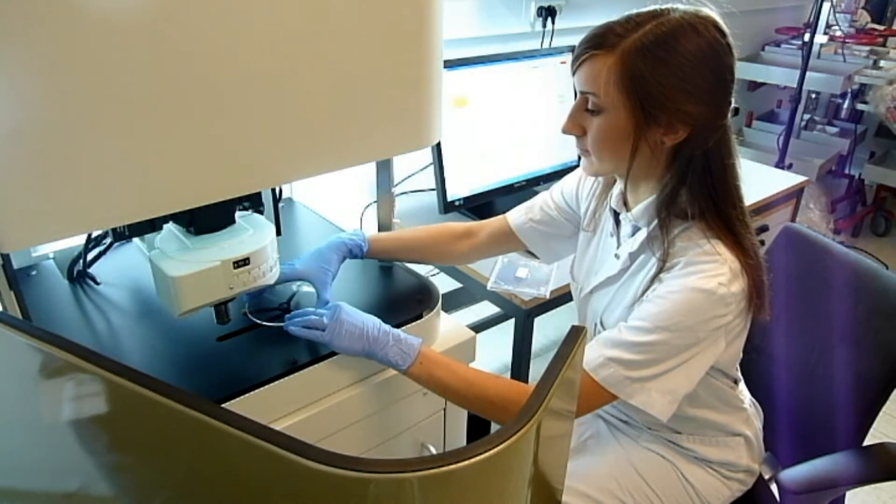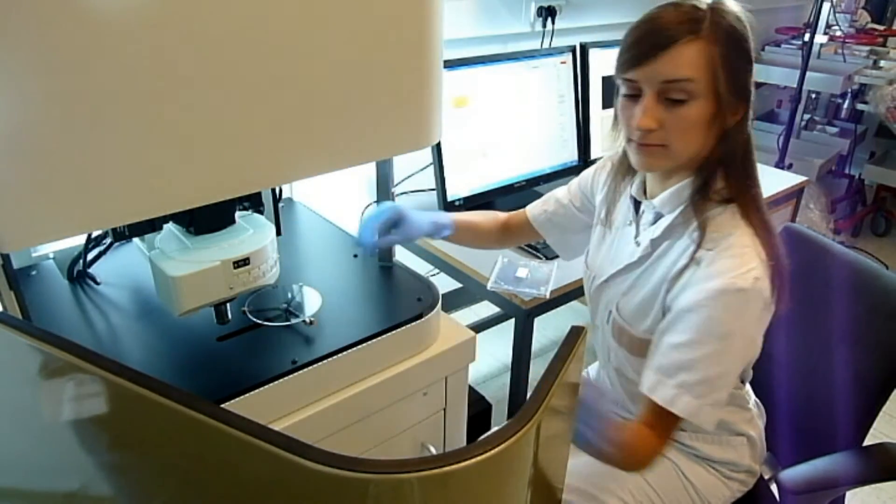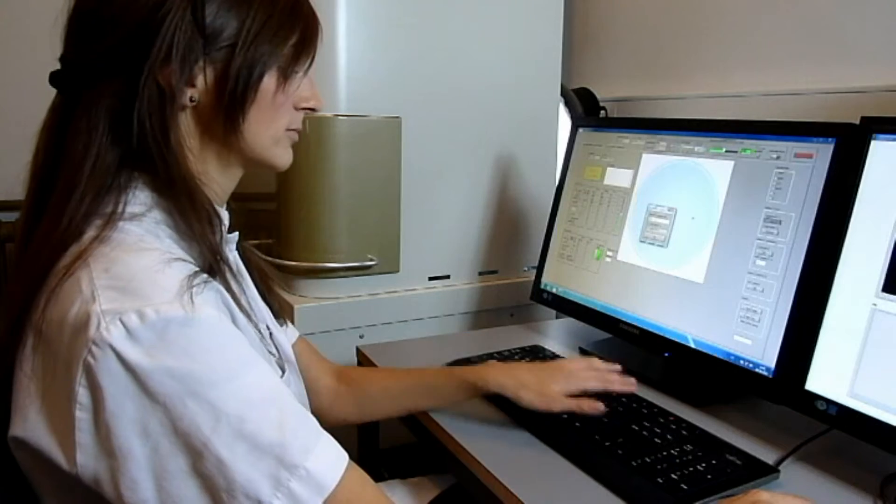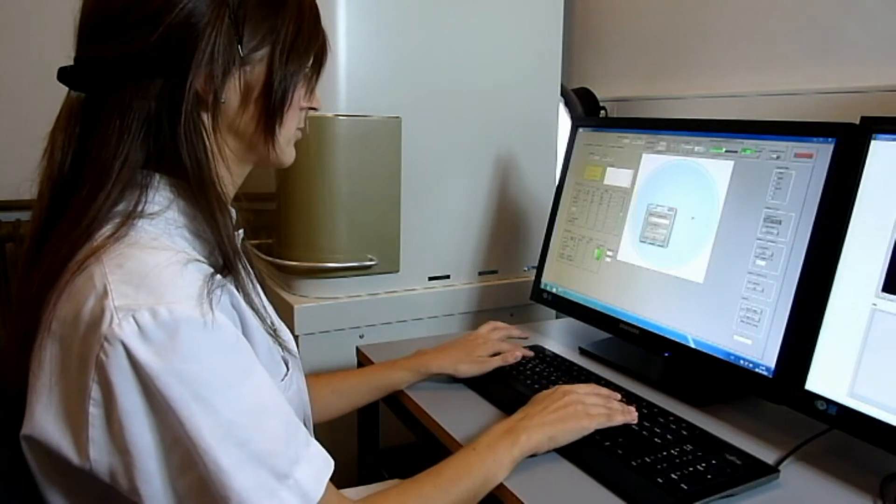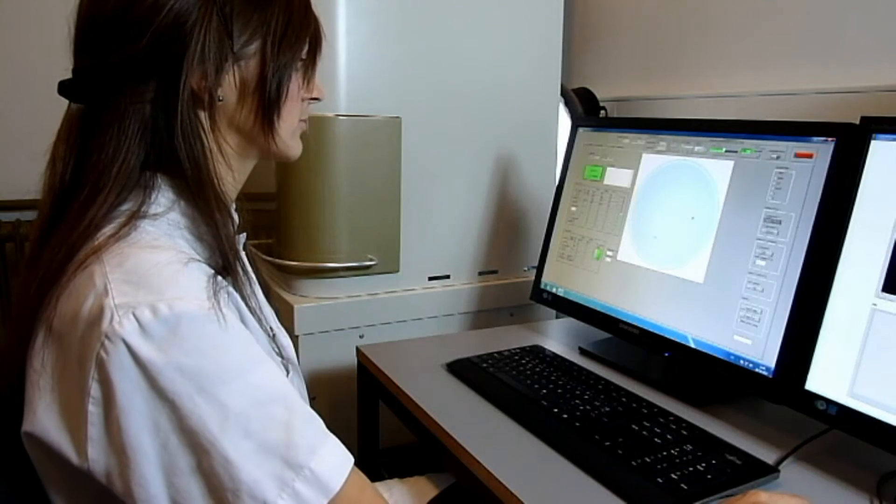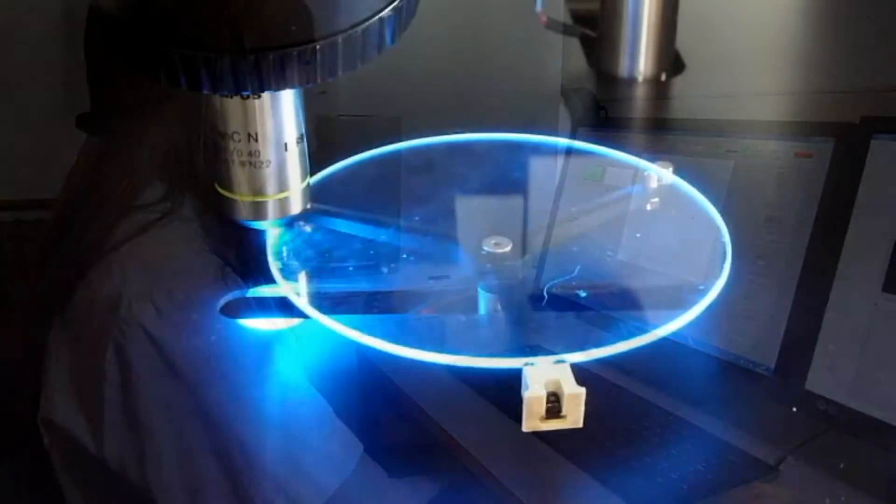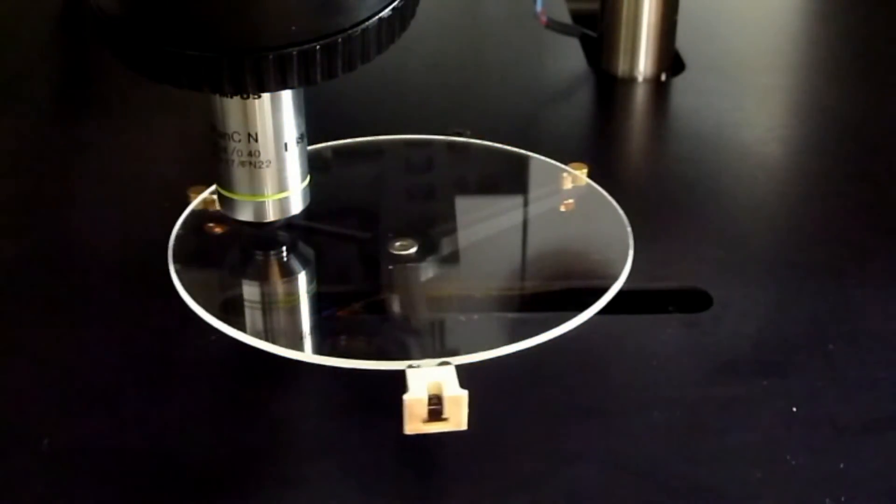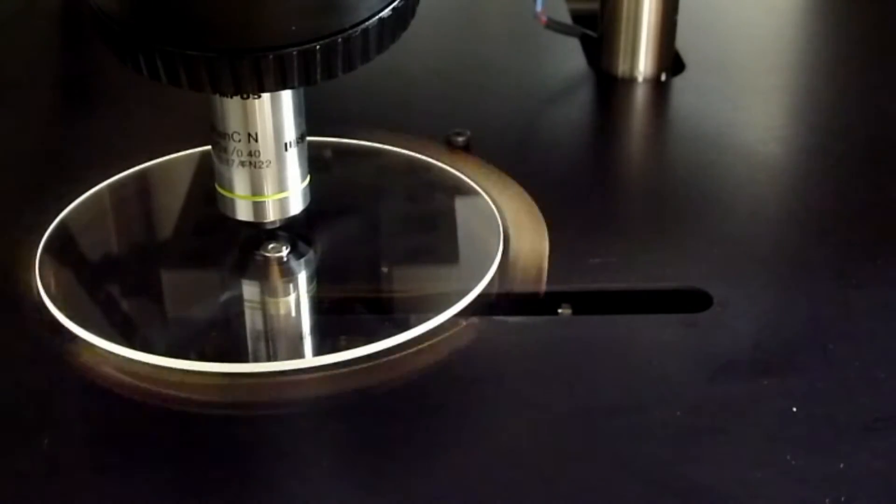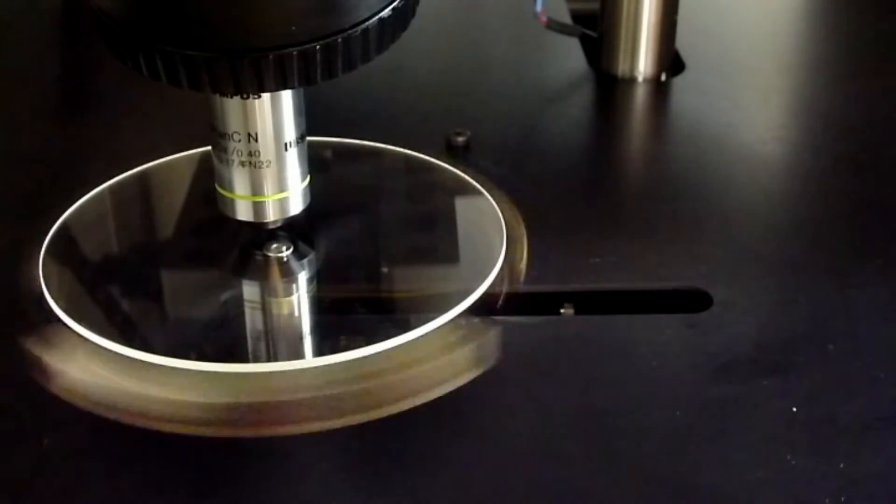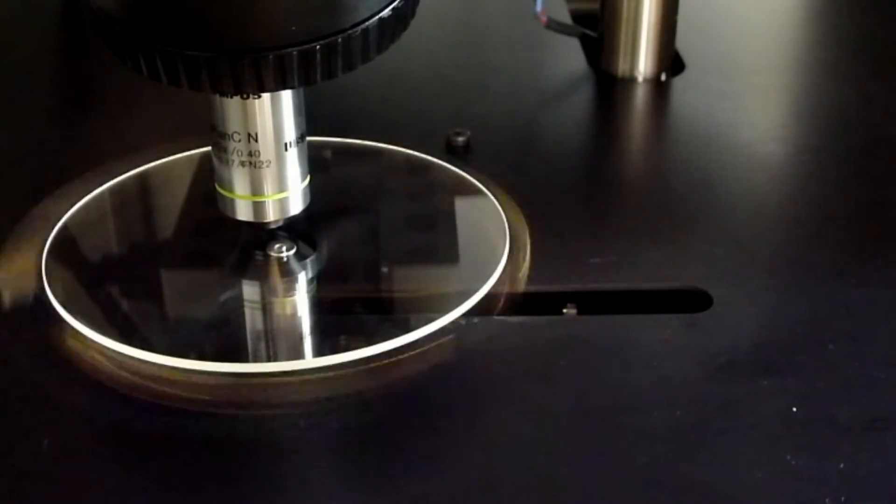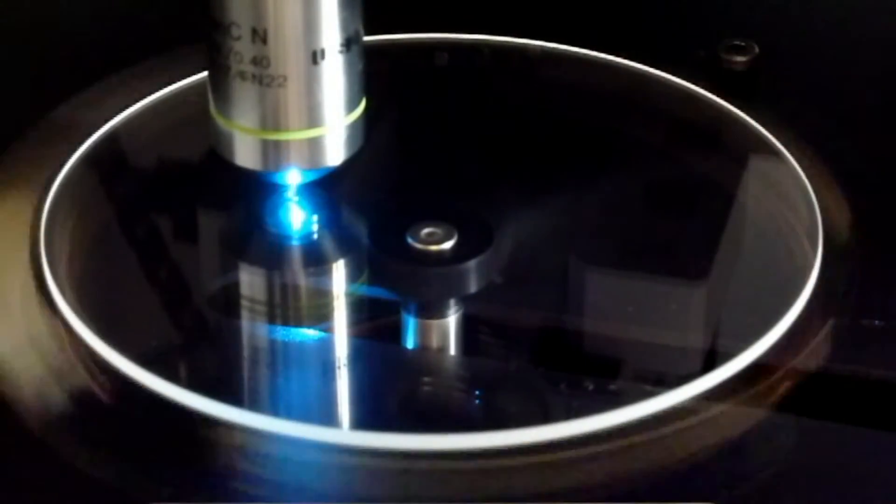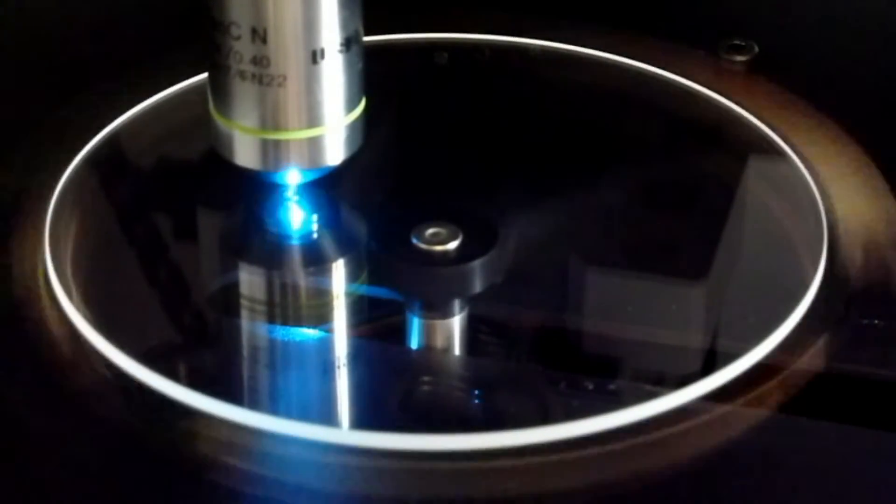The glass disc is mounted in the Cytotrack scanner. The scanning procedure is initiated. During the scanning, all data are processed in real-time by the Cytotrack control system. After only one to three minutes, the primary scanning procedure is finished.